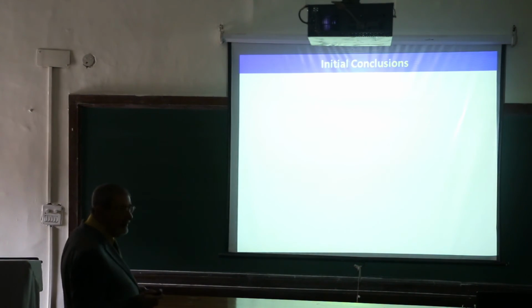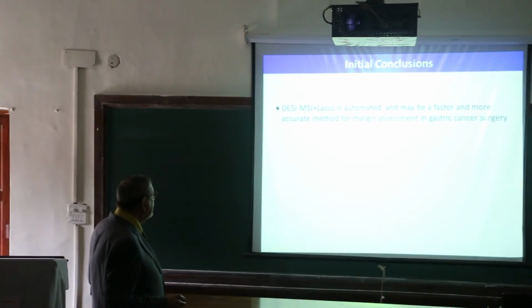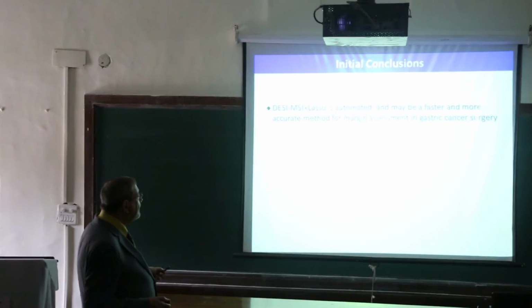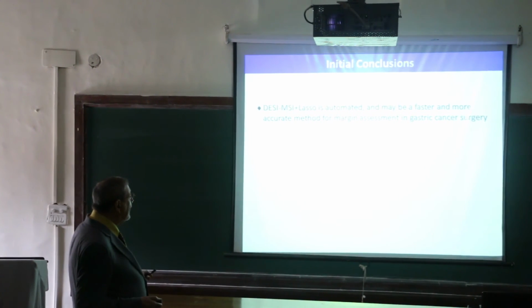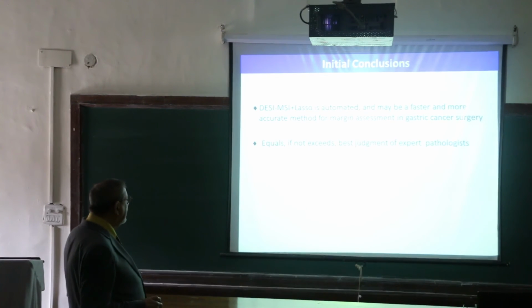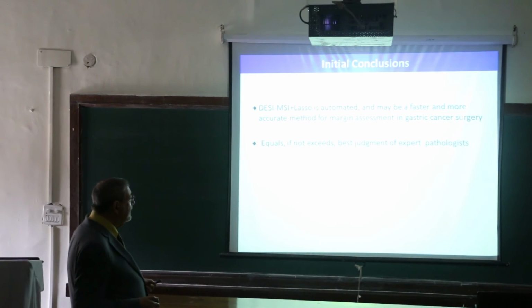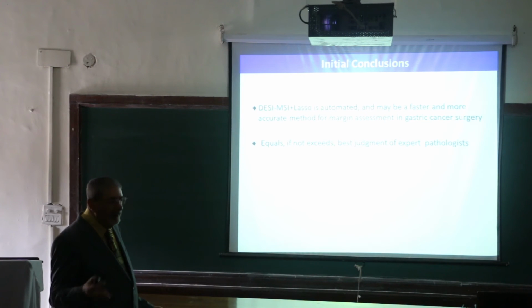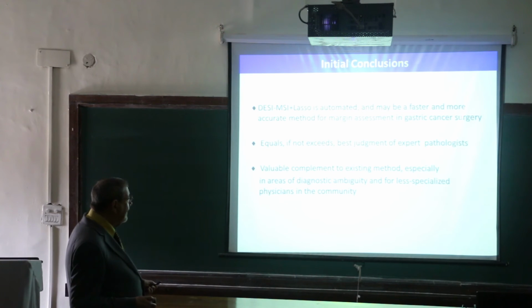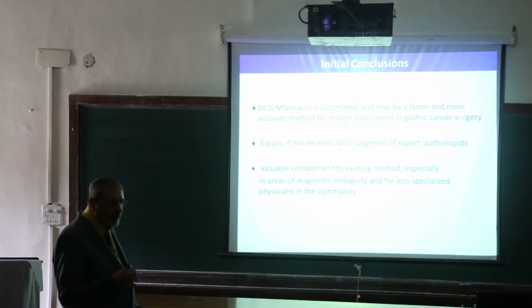Okay, so here's some initial conclusions of this work. The DESI, MSI, plus the LASSO can be automated, and it can be faster and a more accurate method for margin assessment in gastric cancer surgery. So I believe. And it equals, if not exceeds, best judgment of expert pathologists. We think at Stanford we have some of the best pathologists, and we're telling you this. And what else? It is a valuable complement to existing methods, especially in areas of diagnostic ambiguity and for less specialized physicians in the community. So it could be quite useful.